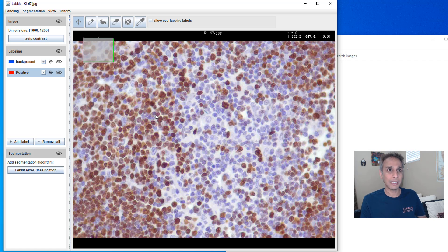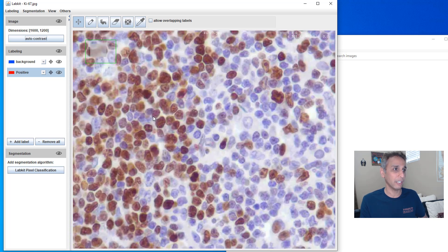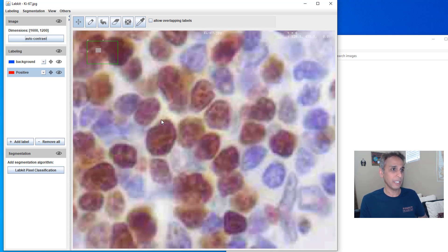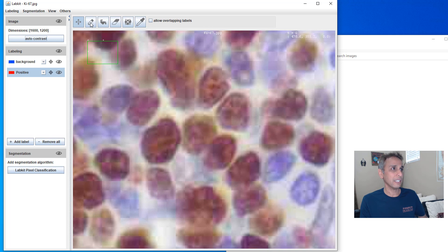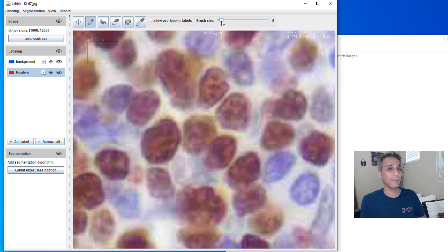Now I'm going to select positive and start drawing. That's it. It's as simple as that but the story doesn't end there. You can make it even better.